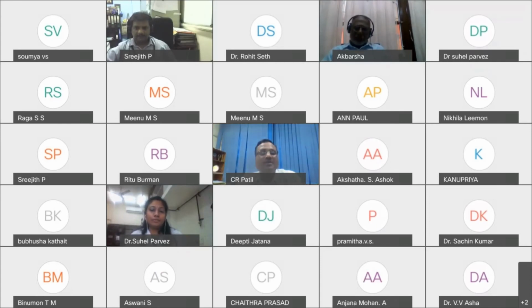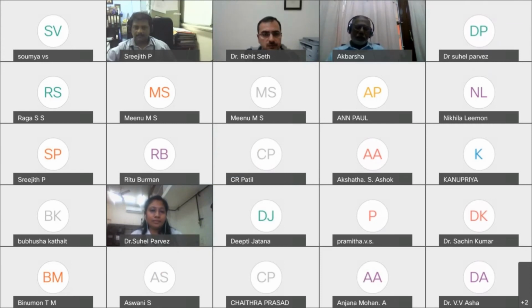Hello, ma'am. Somebody is asking. Introduce yourself. I'm Ritu Verma. I'm from GGV Bilaspur. I have a question, ma'am. When I'm using a high-fat diet, the flies get sticky with the vials and with the food itself. Is there any solution so that it won't stick, or I may reduce the stickiness of my food or the vials? I wipe it with tissue paper, but still it gets sticky after 24 hours.